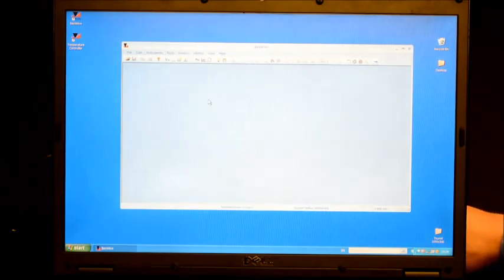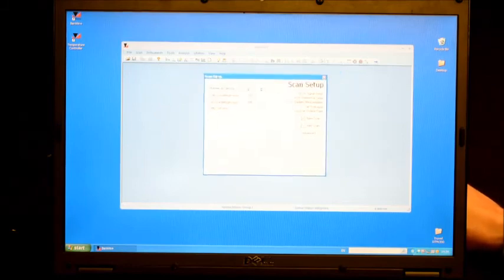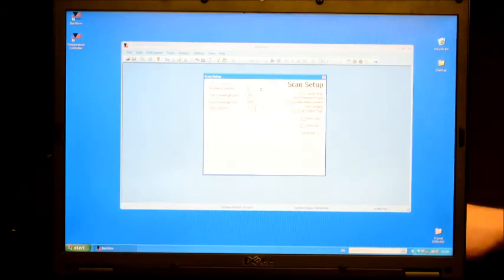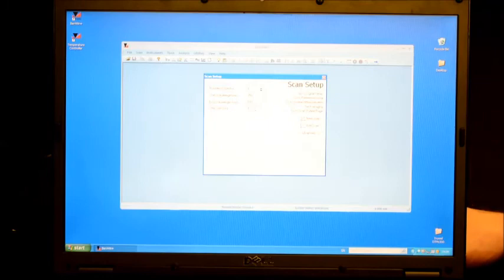The essence of the software to start doing measurements is to go to scan setup, where one can define the number of spectra to measure, the start, end wavelength and step size. All of the measurements that will be done with benwinplus will invariably be through scan setup, although in the measurement of solar irradiance the schedule editor will be used to permit the system to automatically record spectra at a defined interval.